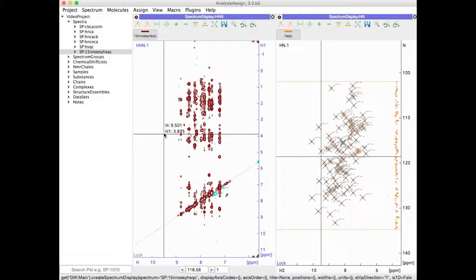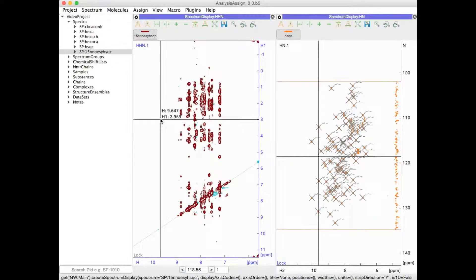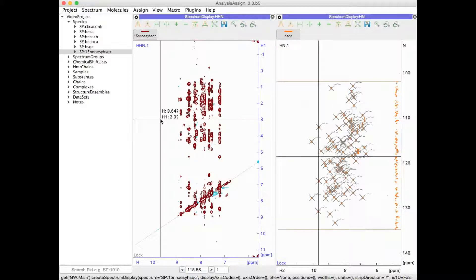By default you always have a crosshair attached to your mouse. If you would like to remove this you can toggle it on and off with CH.